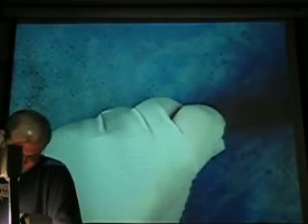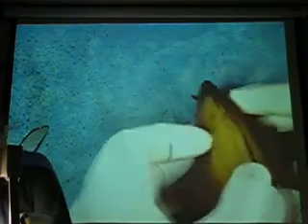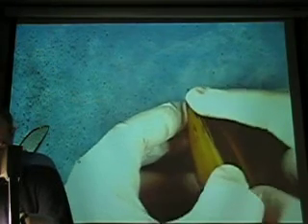What kind of shell is this? Lecture material. Calcium. Calcareous — very good. What layer are we looking at here? We're looking at the outside. Periostracum. Got the P right. Periostracum. Got to liberate you of this piece, son. Don't want to hurt yourself. See, I actually cut through that. That's pretty good.